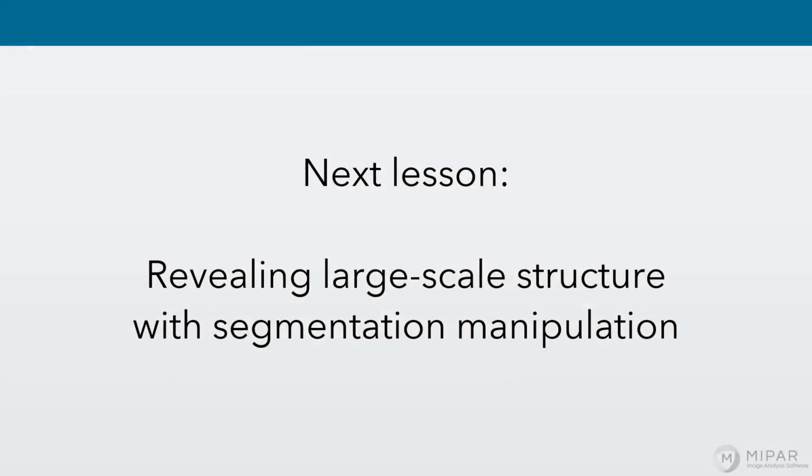That's it for this lesson. Next time we'll do some large-scale segmentation manipulation to take our alpha segmentation and separate it into primary and secondary. So I look forward to working with you then.